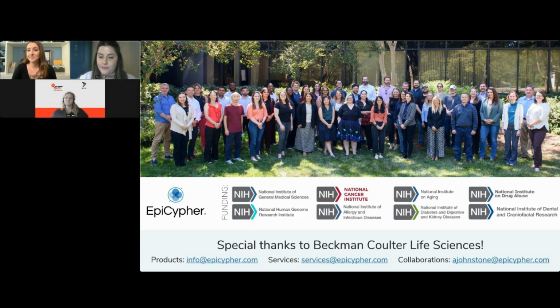Fantastic, thank you. As a follow-up question to that, is the auto cut and run method available on the Biomek i7?